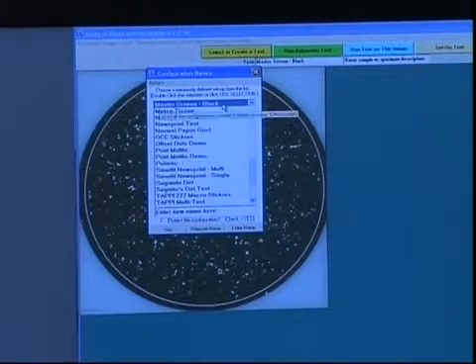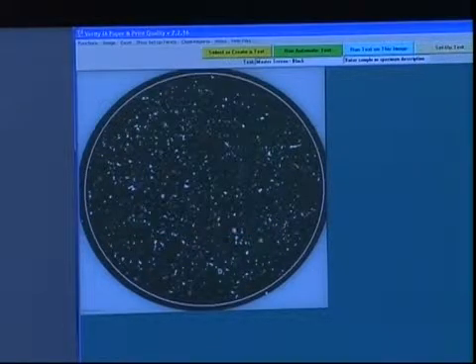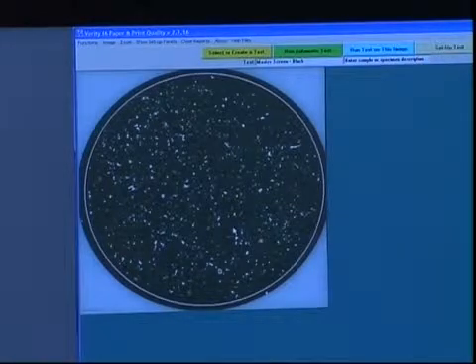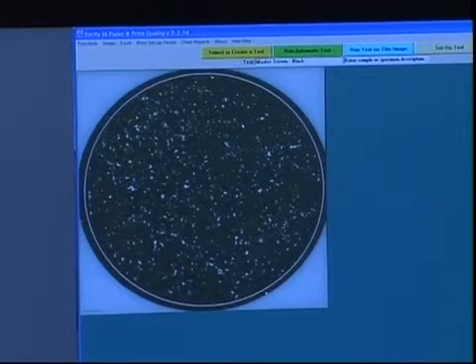We selected the master screen, which is what the name of the POLMAC is, a POLMAC master screen, and the black image area. So we're done with that. This is the scanned image that was stored in memory, done previously. And you'll notice up here in the right-hand corner, we have 3 classifications.